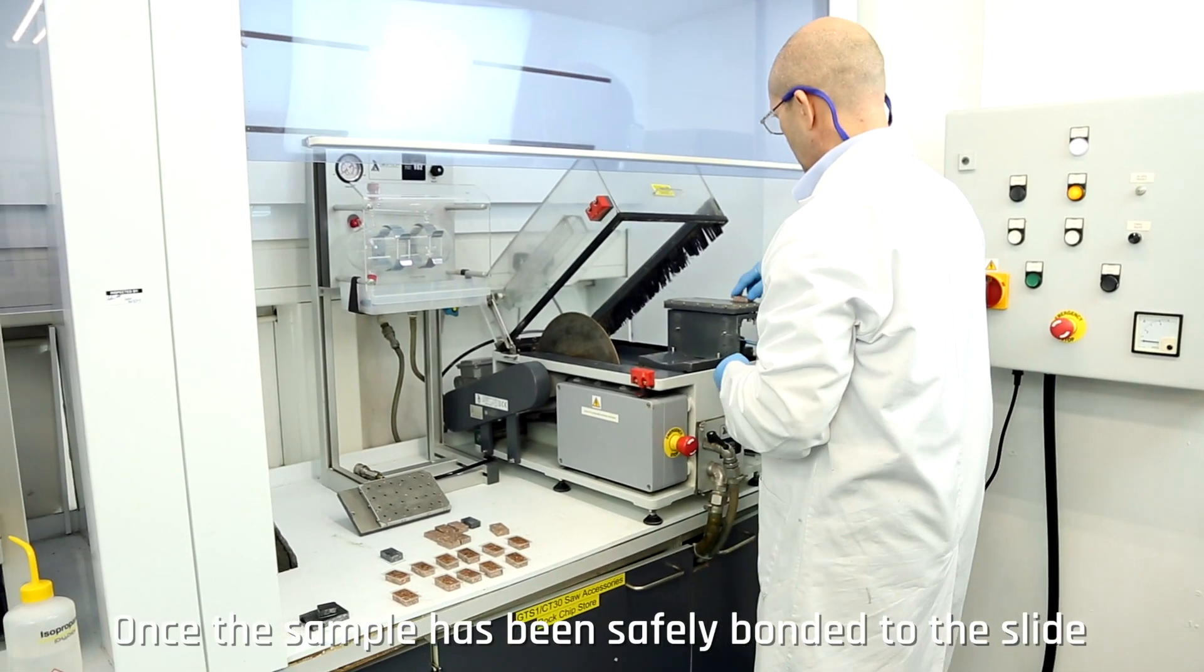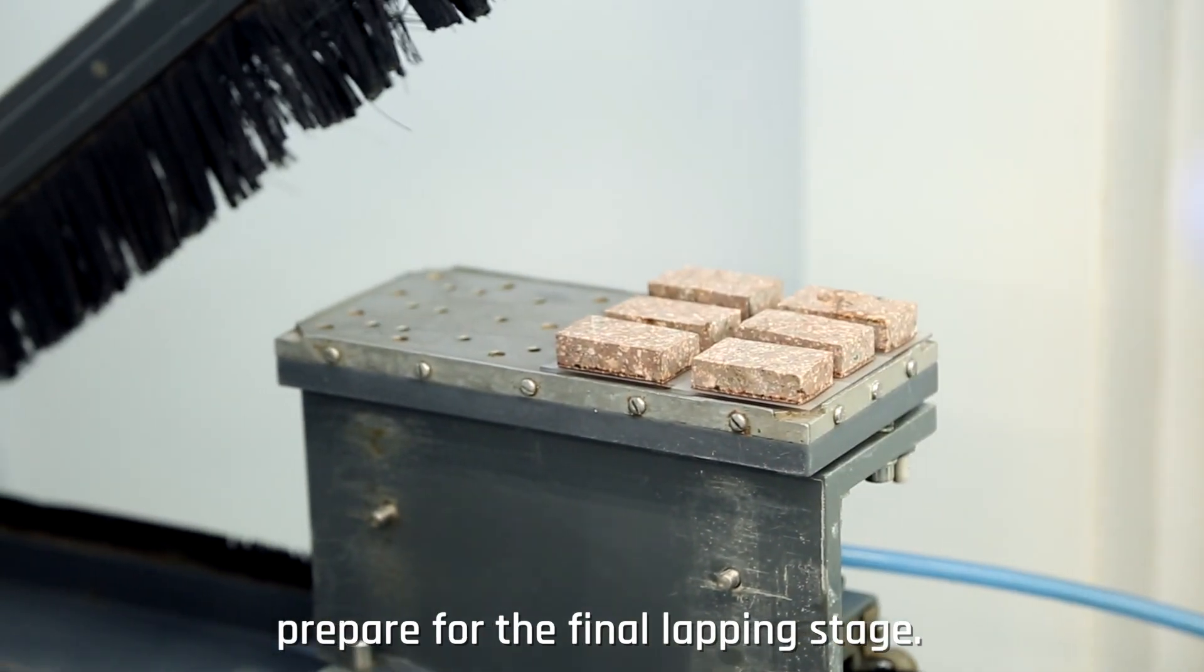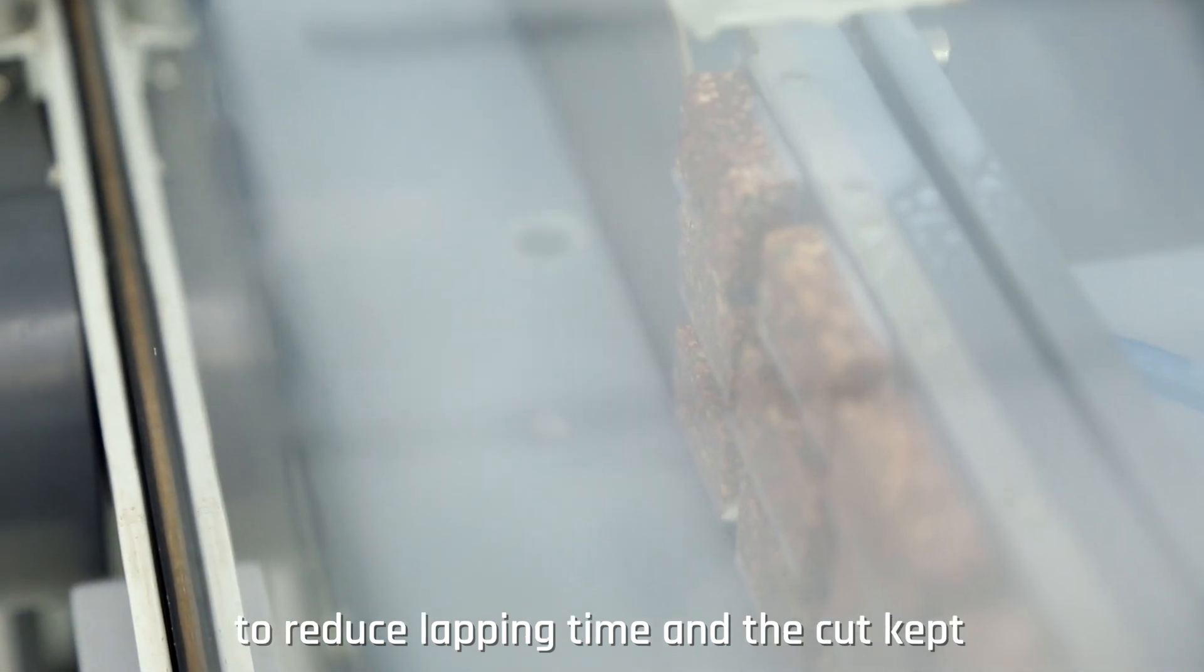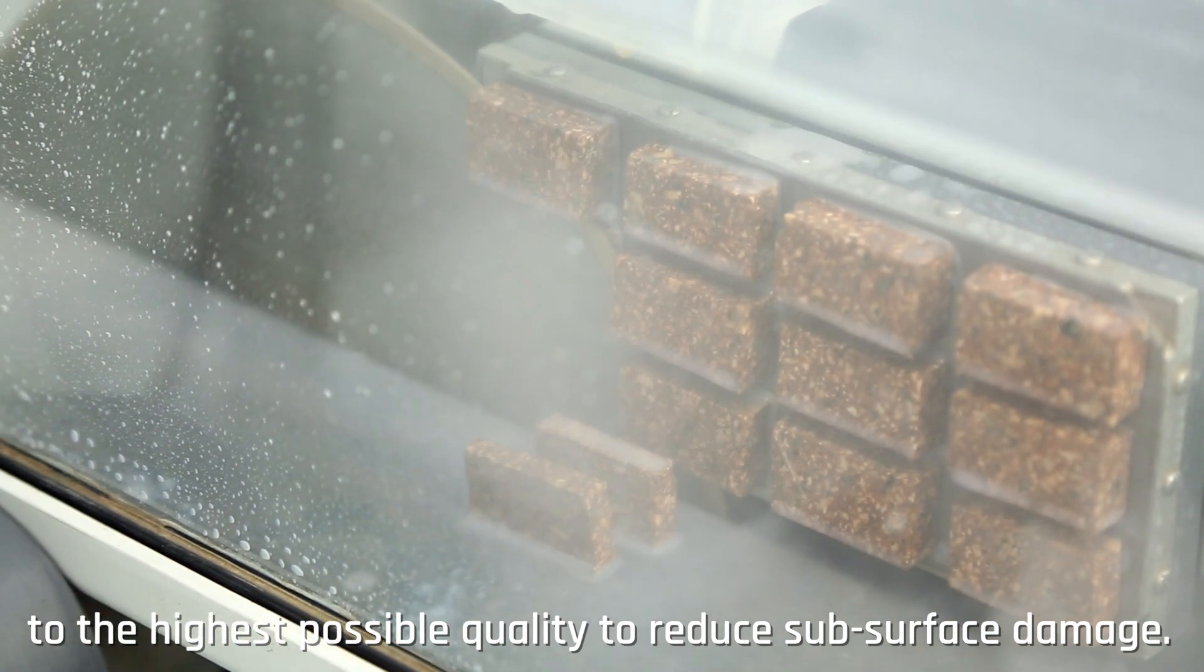Once the sample has been safely bonded to the slide, the excess sample material must be trimmed to prepare for the final lapping stage. The thinned rock sample should be as thin as possible to reduce lapping time and the cut kept to the highest possible quality to reduce subsurface damage.